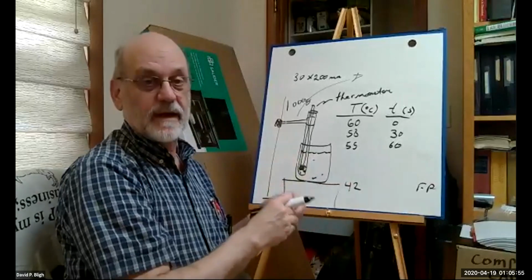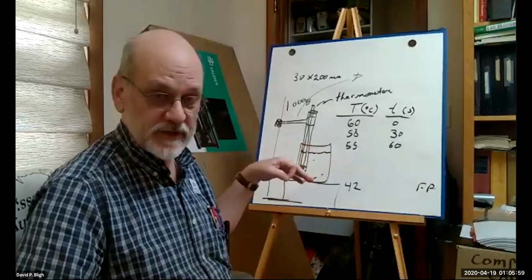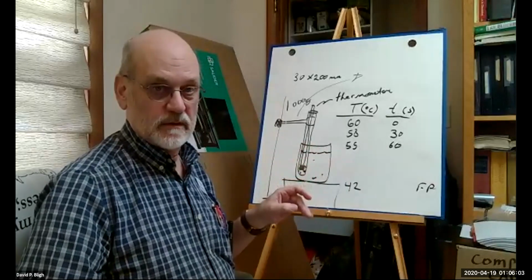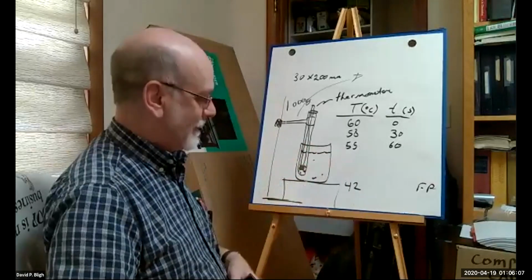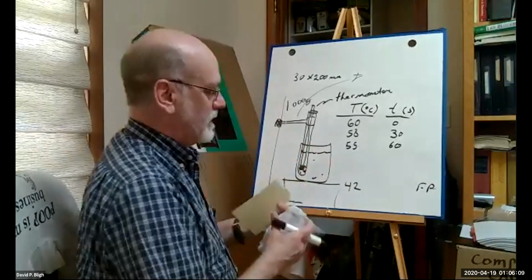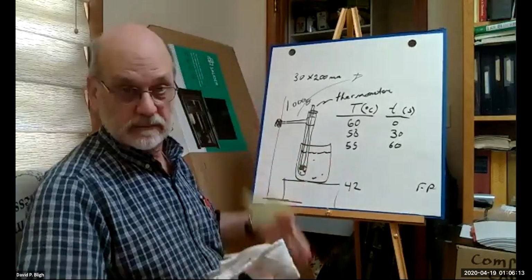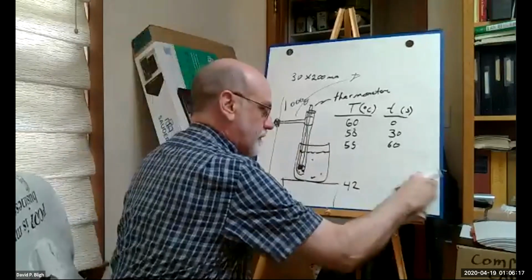Right? And the data point that you're interested in, once you get those 2 freezing points, is their difference. How much did they change? And we don't care about the sign. Remember, it's an absolute value. All right, so that's the hands-on part. You got your data now. Now what do you do with it?